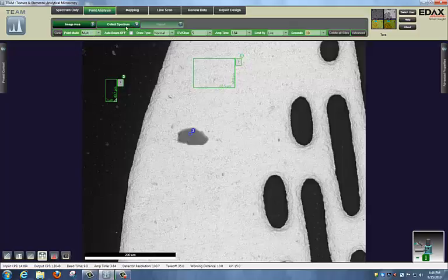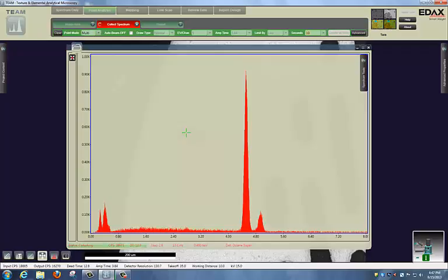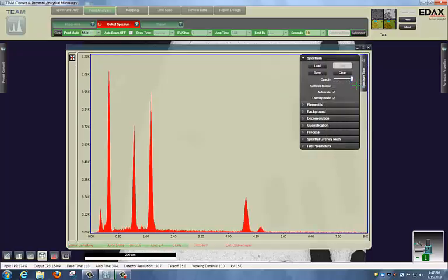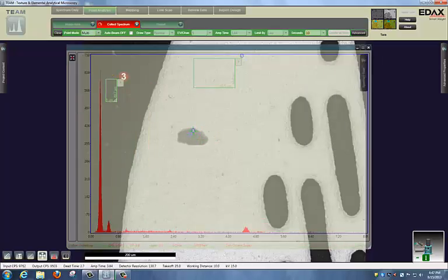Now that I have my areas defined, I just click on my Collect Spectrum, and it'll start the spectrum collection. At each area, it will have individual element lists, and when it's done with each area, it moves on to the next spot and does a new expert ID identification. We could see the area behind here, knowing that it's area 2 and now area 3.